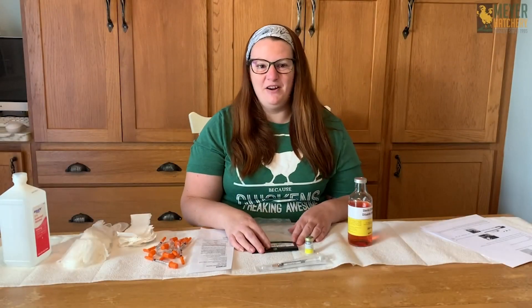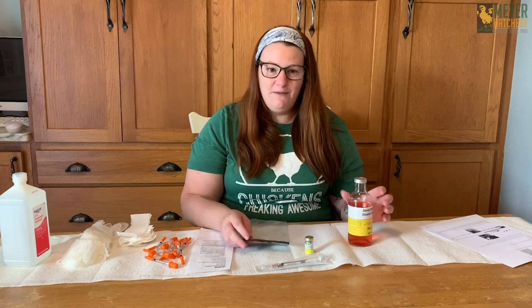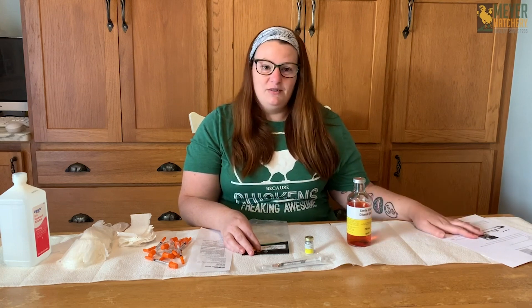Hi everybody, it's Tessa from Meijer Hatchery. Today I'm going to be vaccinating some of my day-old chicks that just hatched. This is my first time mixing and administering the Merck vaccine, so bear with me — I'm going to be reading instructions as we go along.